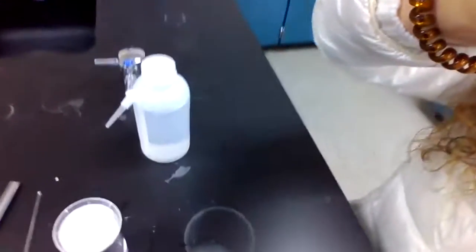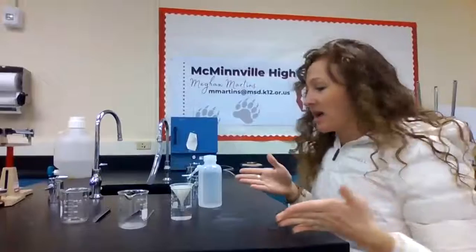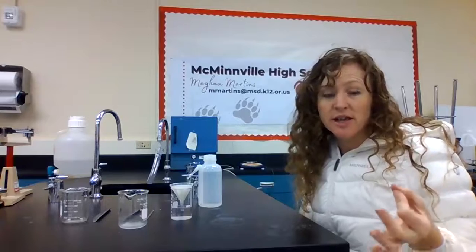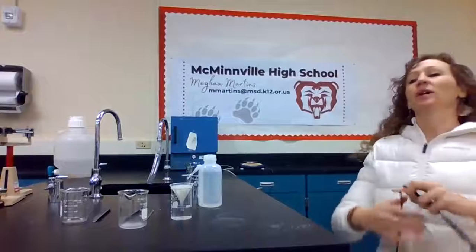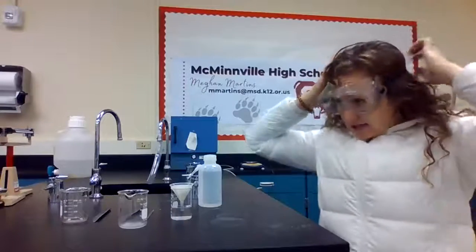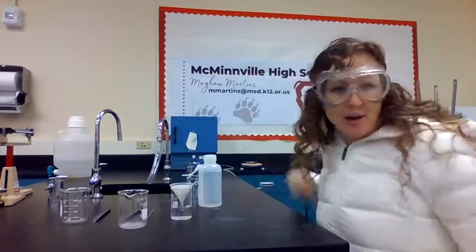Okay, so our sample has finished draining. Let me show that to you. Ta-da! So we want to dry that now, because if we weigh that solid as it is, we're going to be weighing the solid, the filter paper, and water. So we want to get rid of that water component so that we can weigh this and just have the mass of the filter paper and the solid. So we can leave it overnight and it will just dry by itself.